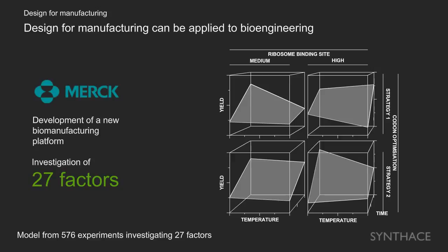Unfortunately, as that organism starts to move up into a larger scale manufacturing environment, controlling temperature becomes extremely difficult. And you wouldn't have been able to unpick the fact that that particular organism was temperature sensitive until you put it into a large scale fermenter and watched your yield drop off. In contrast, by being able to conduct these complex experiments that could allow you to build models iteratively, you could unpick that by locking in with 2 different genetic attributes, you could build an organism that was robust against temperature variation and was still going to operate successfully once you move it into large-scale fermenters.